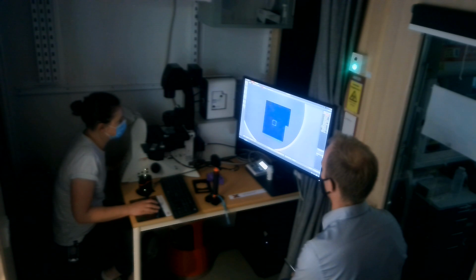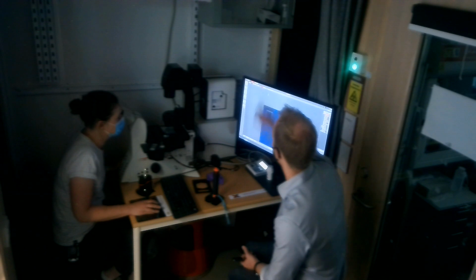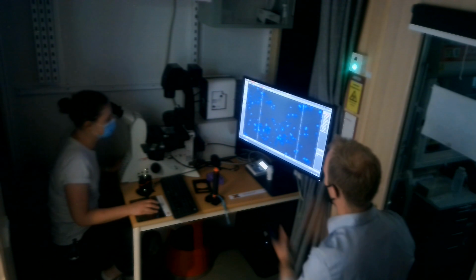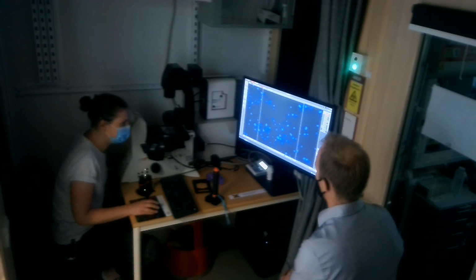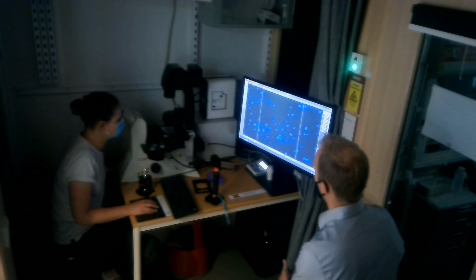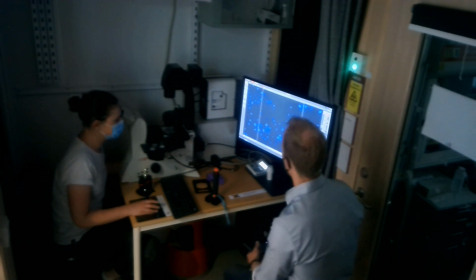And now if I would see, I could just go here, for example. If you want to zoom in and get that one good, you can click on that little button and it just blows that up there perfectly. And yeah. So if you go live now, you can also see if you still have very bright signals there.